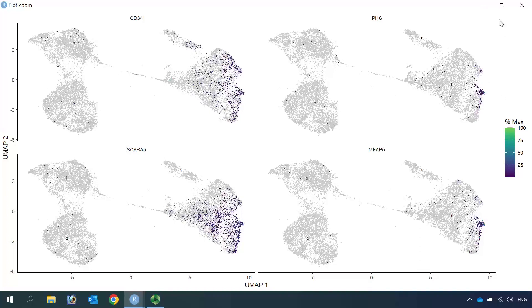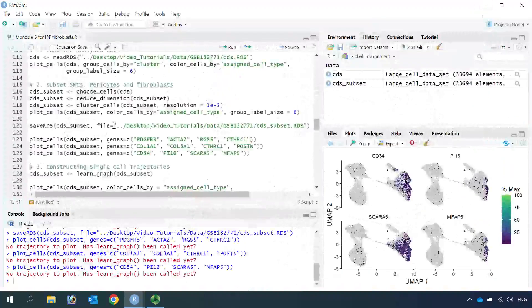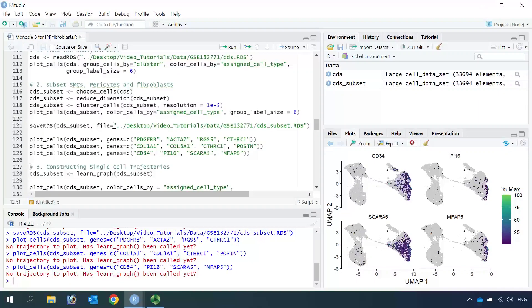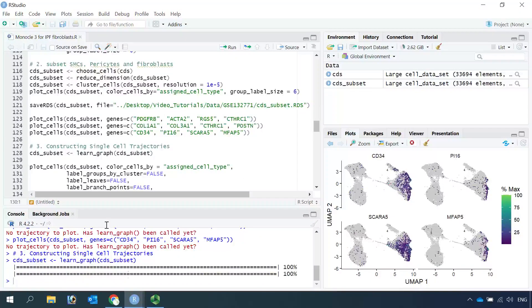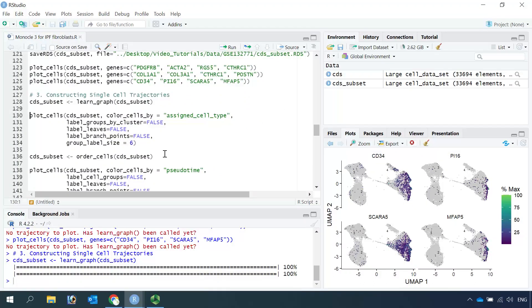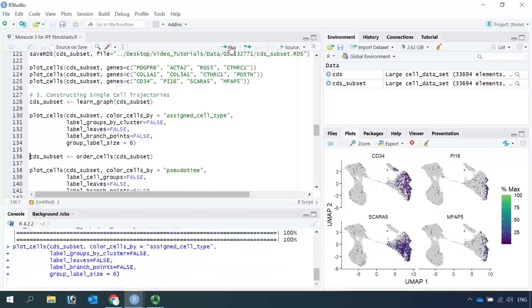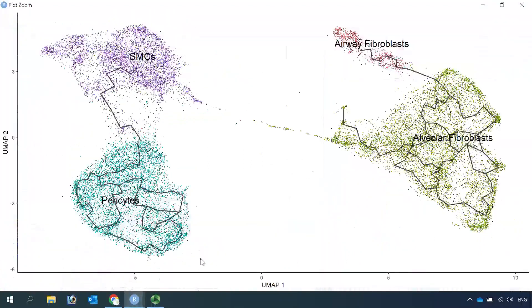Now we are ready to perform the trajectory analysis. Because we analyzed the single-cell RNA dataset using Monocle3, we can run the next step to learn the graph. Let's plot the cells before we order them by pseudotime, coloring by cell type. After Monocle3 learned the trajectory graph, it draws two projections: one from the smooth muscle cells to the pericytes, and the other for the fibroblasts.